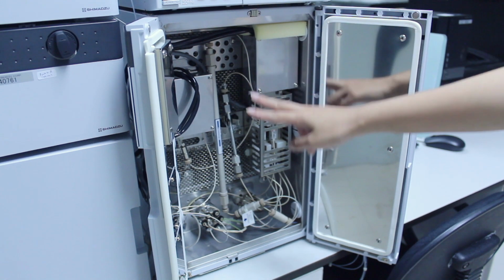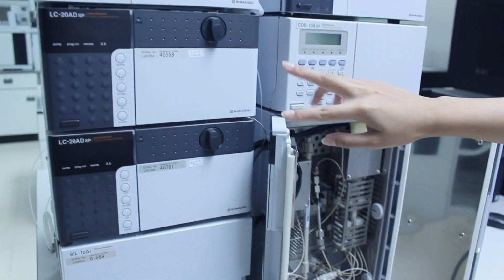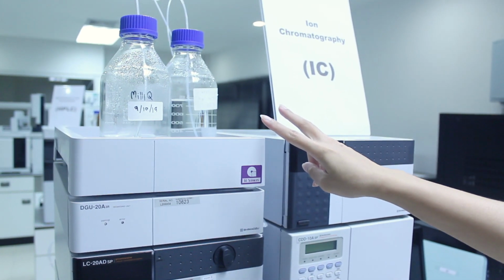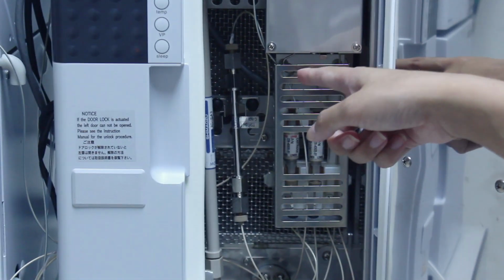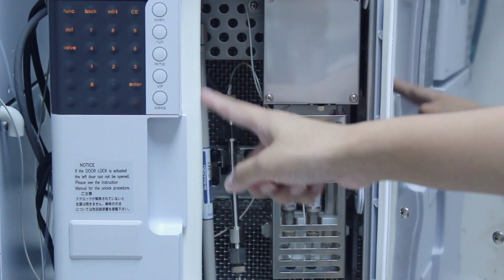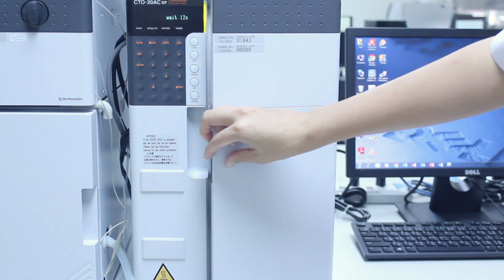And since cation and anion analysis require different mobile phase, there are two delivery pumps for carrying two different mobile phase into the system. Furthermore, this IC Shimadzu LC series has a fan installed at the back of the column to provide a forced air circulation system, which is an ideal system for high accuracy thermal control within the oven.